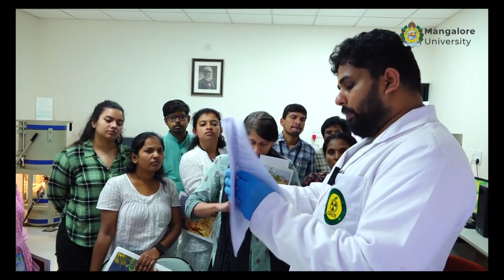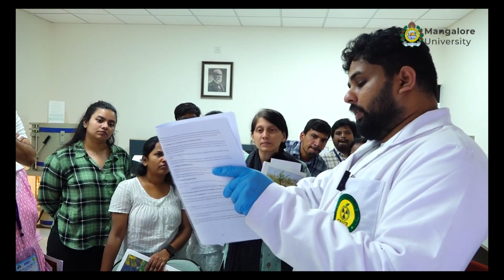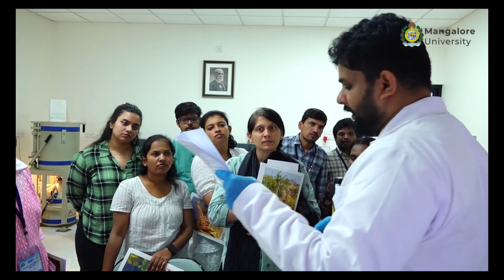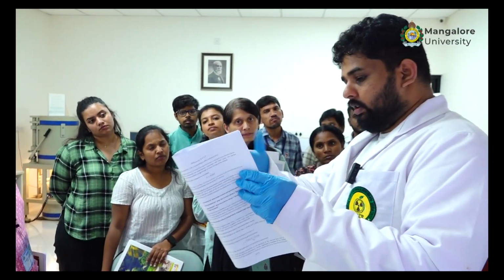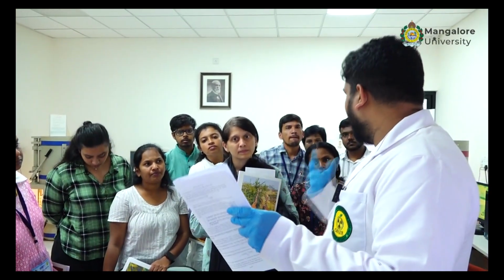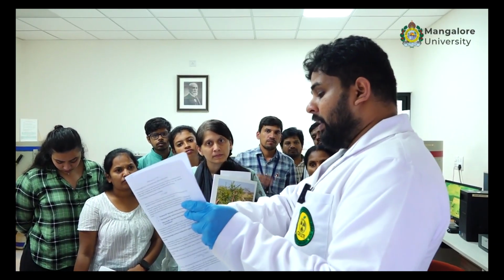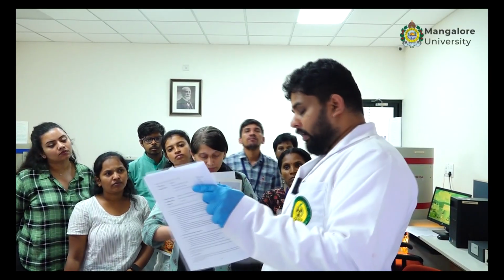And sediment 3-4 is not applicable for us. So sediment samples 5, 6, 7, 8. They have given a cesium-137 activity, and 7 is not applicable in this case because it is strontium-90, can't be analyzed here. So these are the only things. Then they will give an end date and some related information on the sample, the requested reports per sample and in what units they require. They have said becquerel per kg for most of this. Sample 5, it is becquerel per sample. So these are all evaluation matrices.